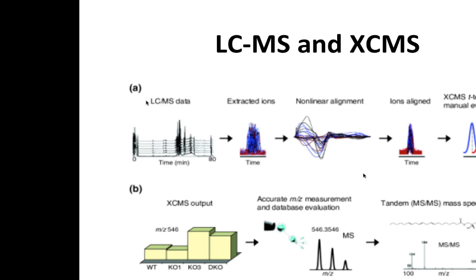So XCMS recently also added support for MS/MS. We're not going to cover this, but just to let you know it does have these features.